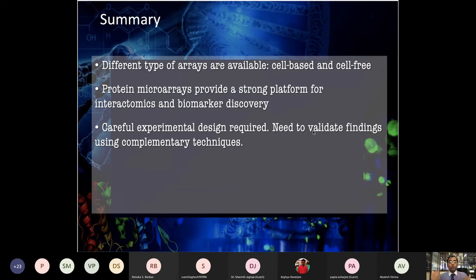Now you can narrow down those proteins, and you can print another array now. Rather than having 30,000 proteins printed, you can now maybe print 500 spots, which is of your interest. And now you can take some of the same samples which you have used from the 200, maybe you can take 50 samples from that, and you can try to see if that is making the same pattern. And also you can take 50 more new samples which can be used for validation of that, and then that could serve as a validation strategy, a validation set of the array.